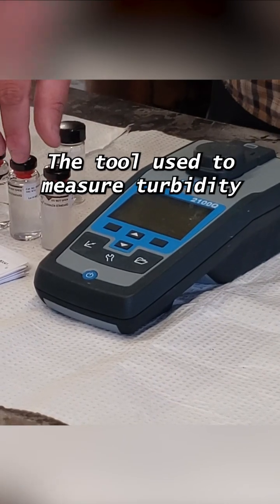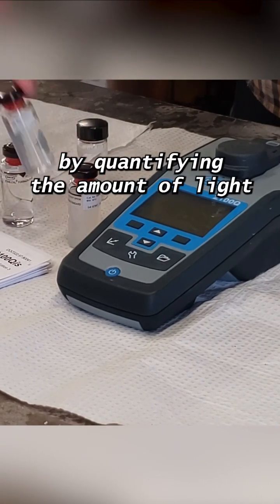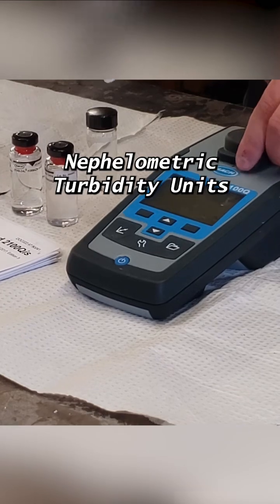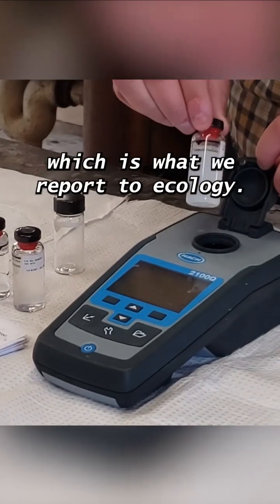The tool we use to measure turbidity is called a turbidimeter. It works by quantifying the amount of light that gets scattered by the cloudiness in our water. It gives us a reading in nephelometric turbidity units, or NTU, which is what we report to ecology.